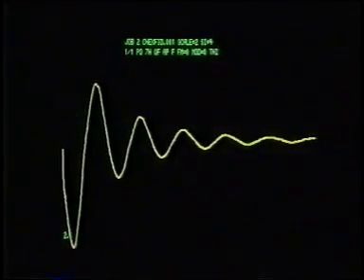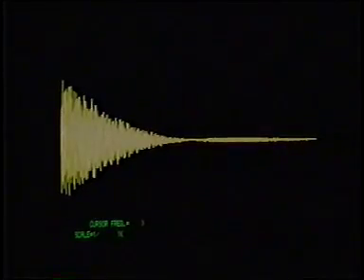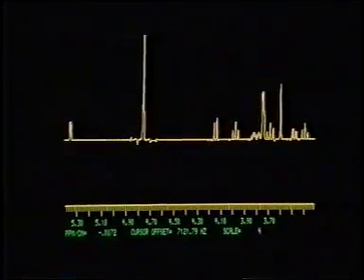More usually, compounds have spectra with closely spaced lines. Then, the sine waves from all relaxing nuclei are superimposed, giving a complex FID showing a distinctive pattern. Such a pattern is similar to an interferogram in FTIR, but all we have to appreciate is that, as in IR, Fourier transformation can produce from it a spectrum in standard format. In another parallel with FTIR, all protons in FT-NMR are observed at the same time, so acquiring a spectrum is fast.